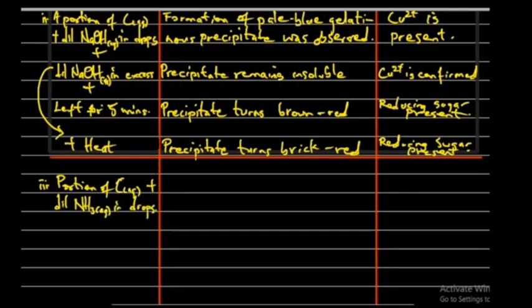We discovered that a pale blue gelatinous precipitate was also formed.